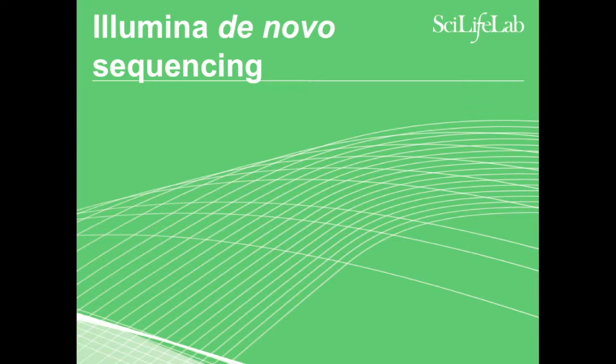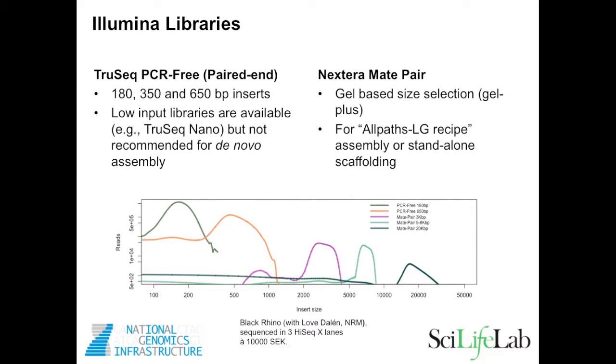So first, I will talk about using regular Illumina libraries. We are an Illumina facility. We have Illumina sequencers, and we prepare Illumina libraries. So this is kind of the main workhorse of our de novo sequencing.